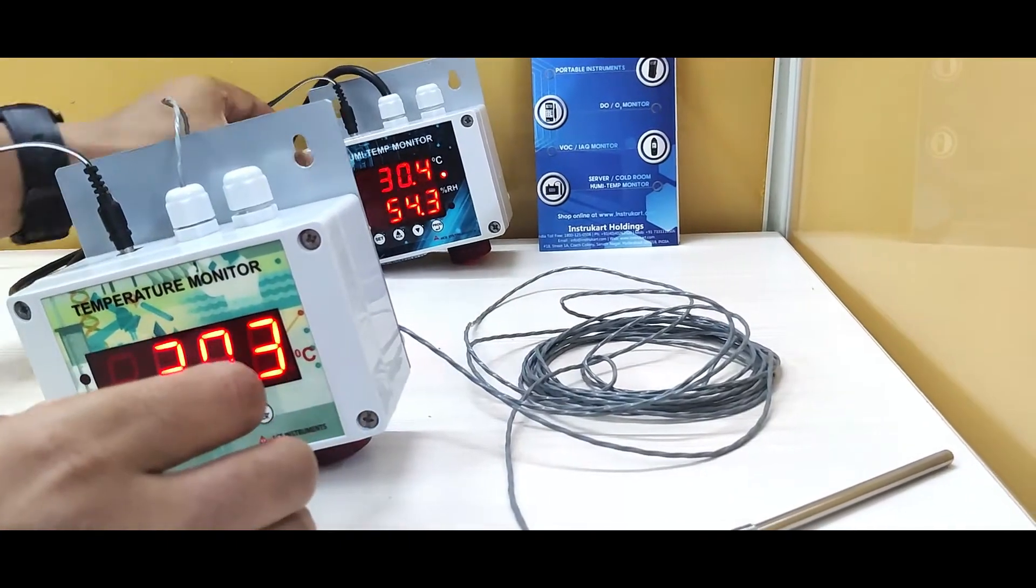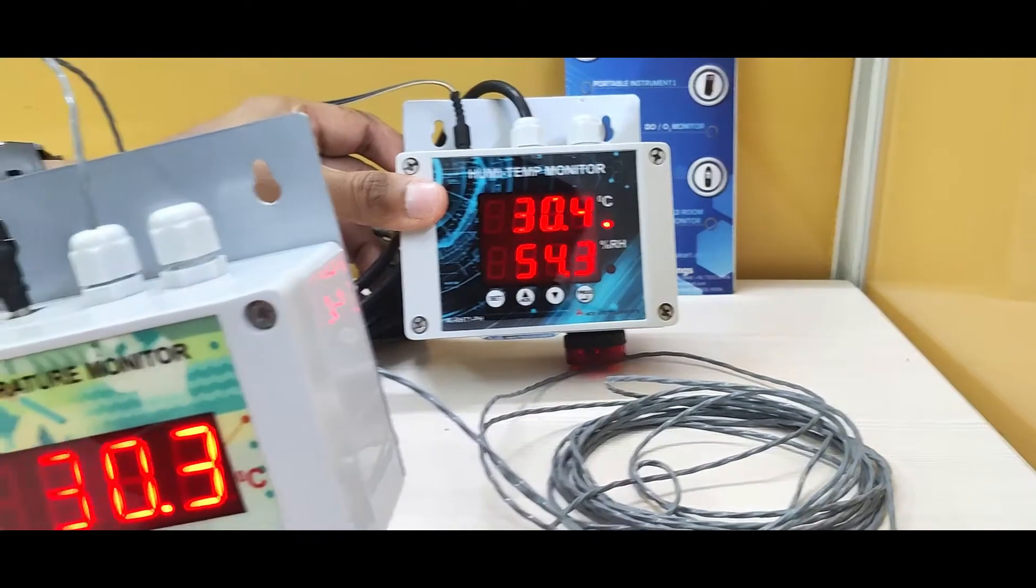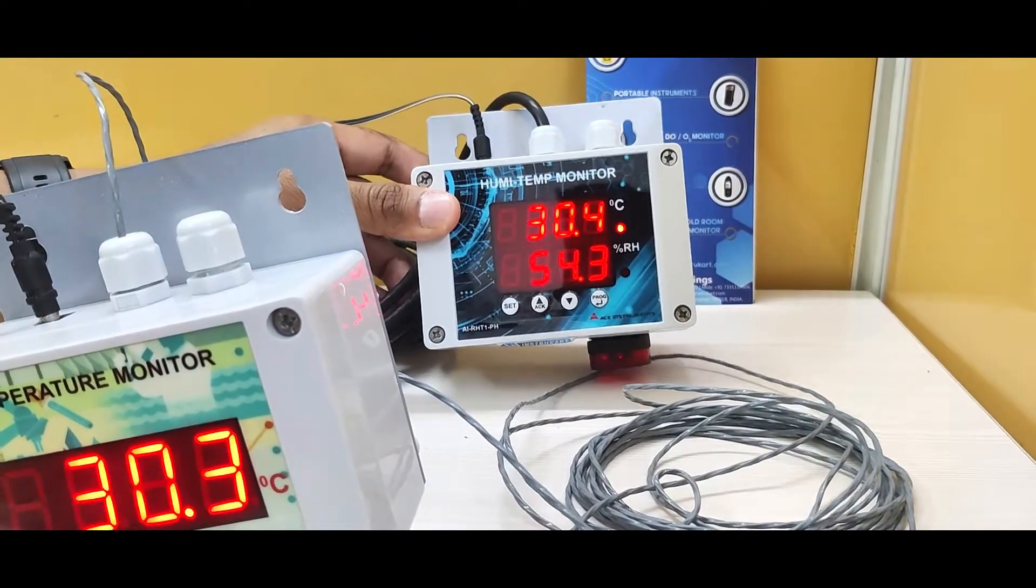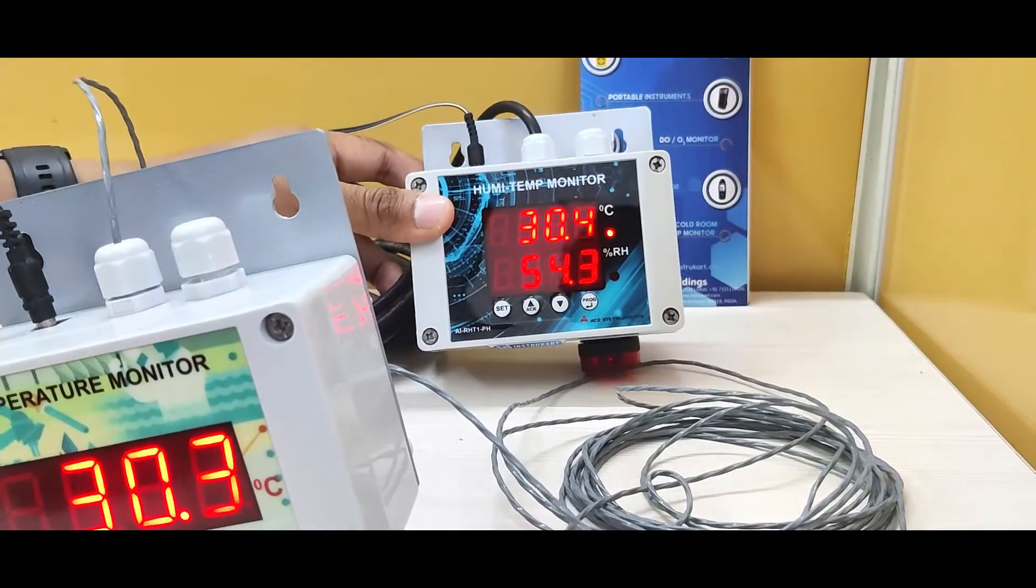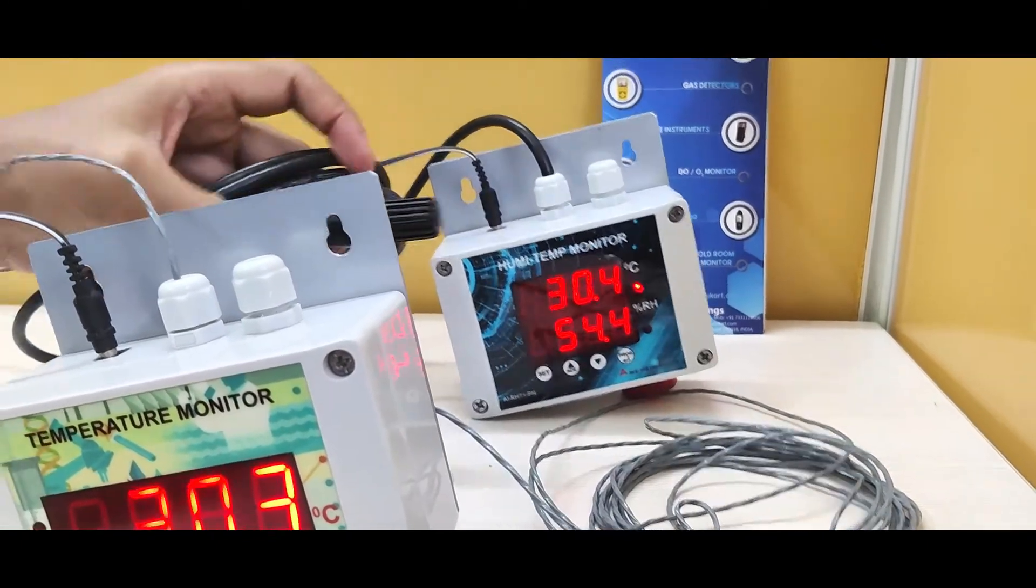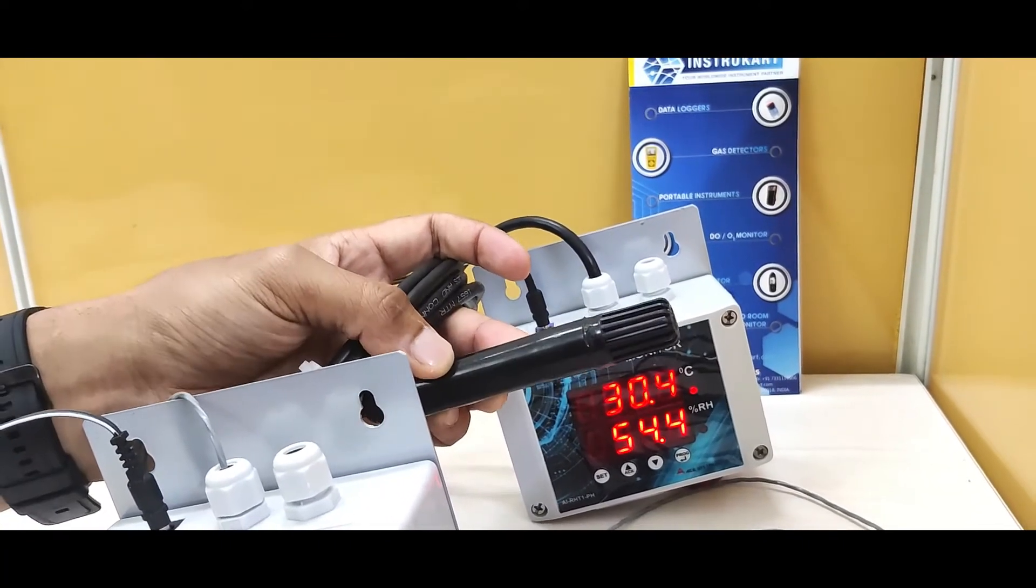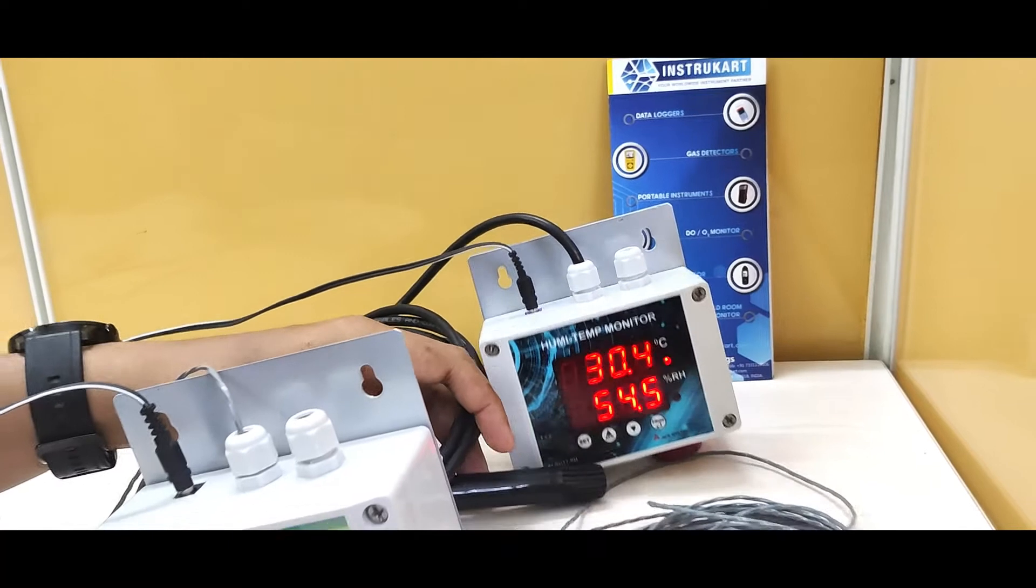Apart from this, in this family we also have the temperature and humidity monitor. All specifications remain the same except that RH is added with a different kind of sensor—a temperature and RH combined sensor for this particular device.